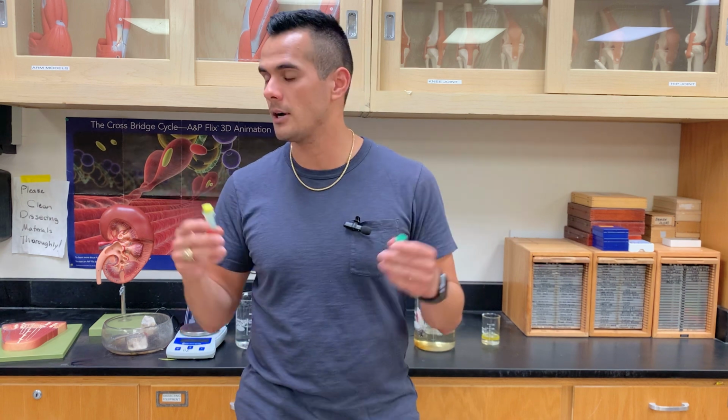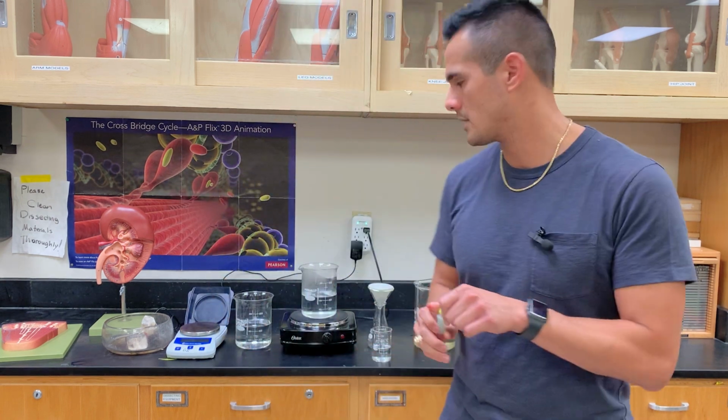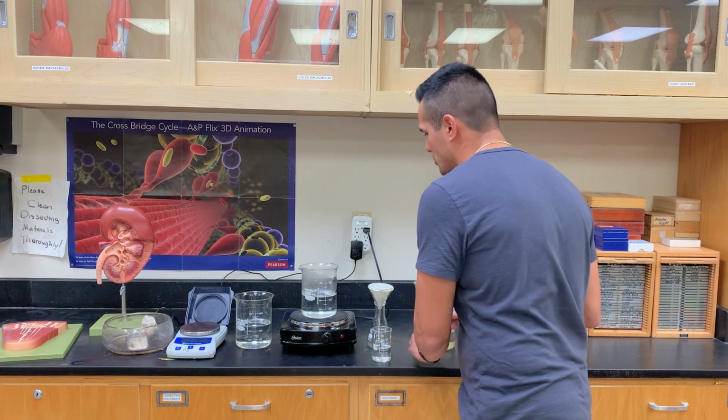Okay? So, are you ready? Yeah? Okay. So go ahead, put a drop in of each.